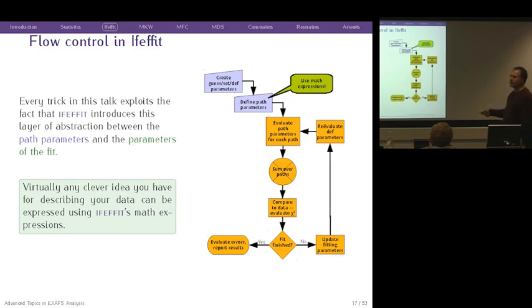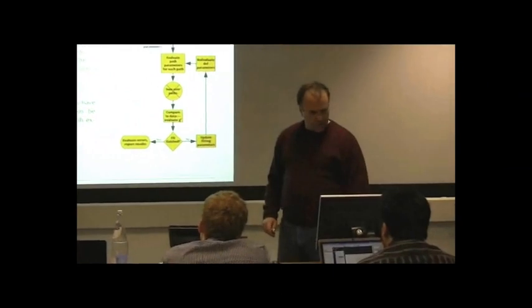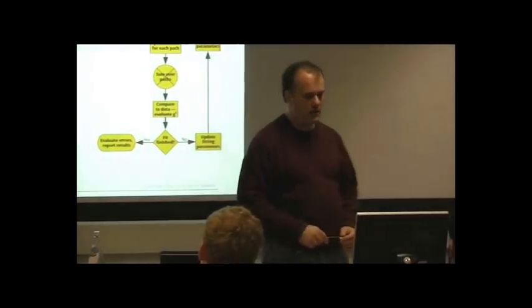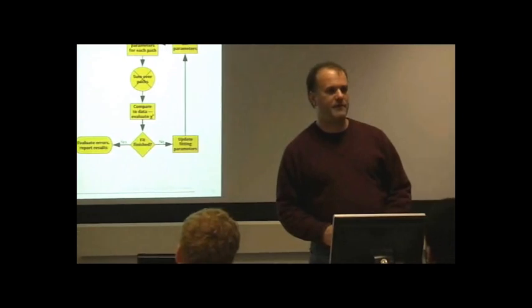That is what happens when you press the fit button. You create a model, press the fit button, go around this loop, and finally finish. That's Artemis. Okay, so before I start to dive into all of the clever tricks that are available in Artemis, I think I should stop and see if anyone has any statistics questions.